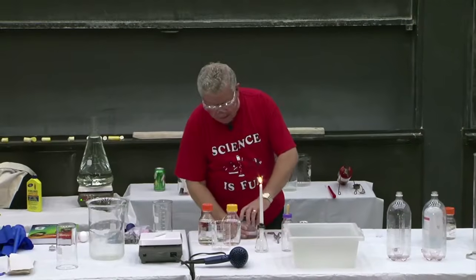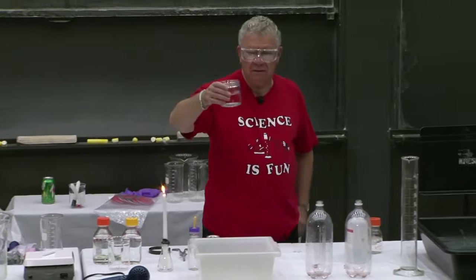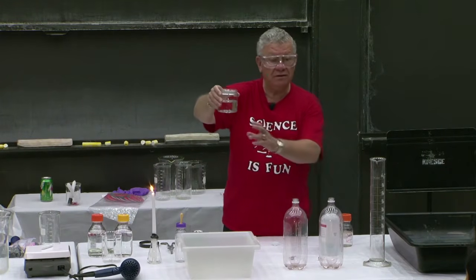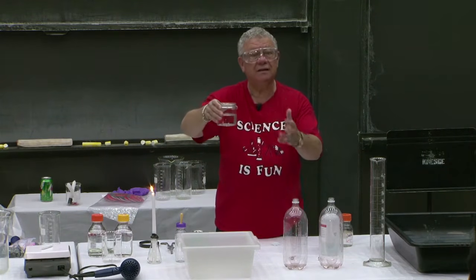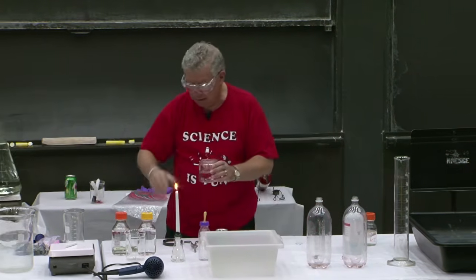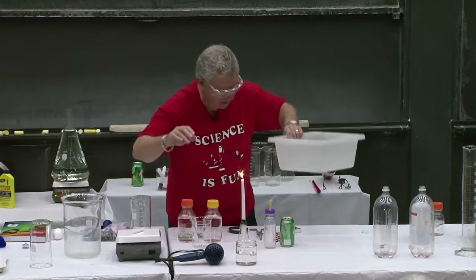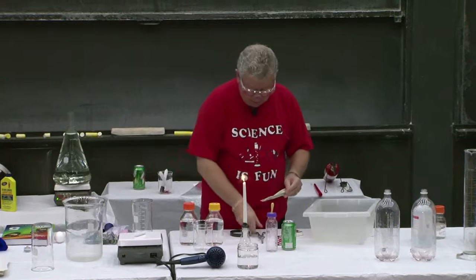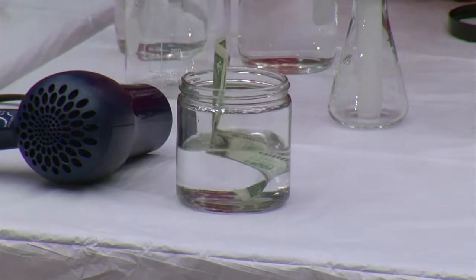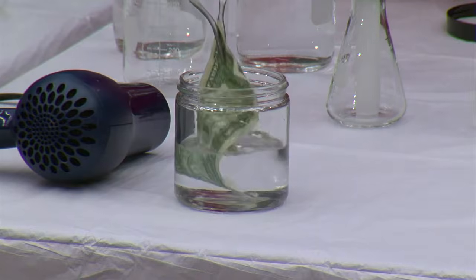Well, I have a jar right here, and I have in this jar a liquid. What does it look like? Looks like water. The way we describe this liquid is to say it's a clear and colorless liquid, which is what water is. Okay? So I want everybody to see the jar right here. Get this out of the way. I'm going to take the dollar bill, soak it in this clear and colorless liquid, which looks like water, and I'm going to fish it out using those tongs.